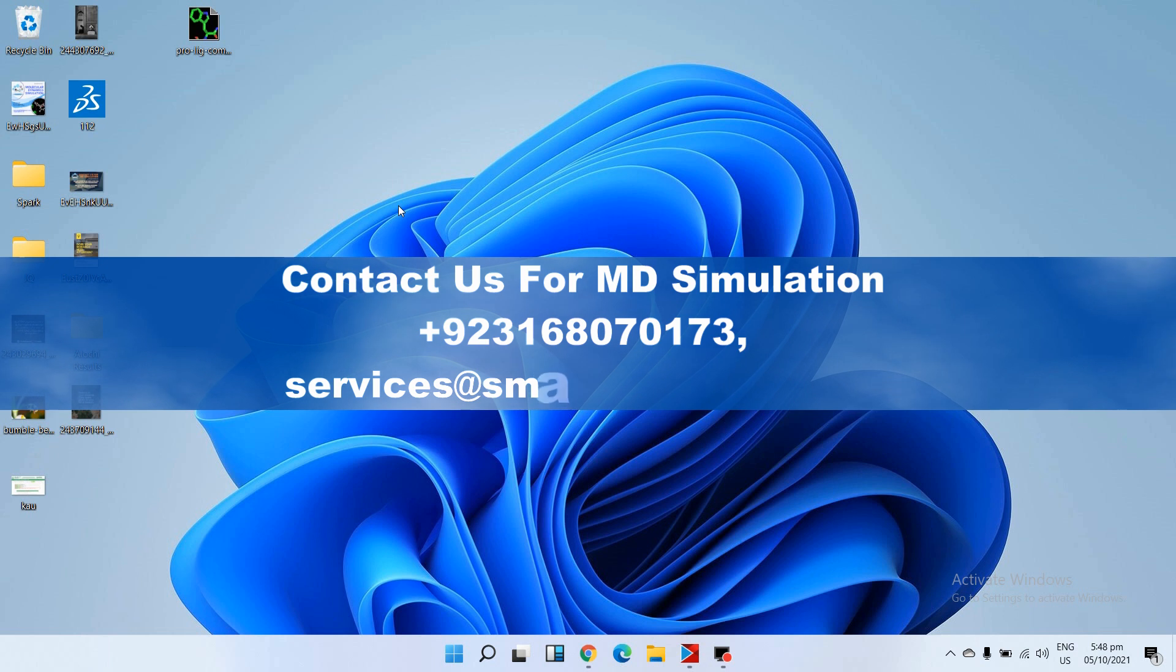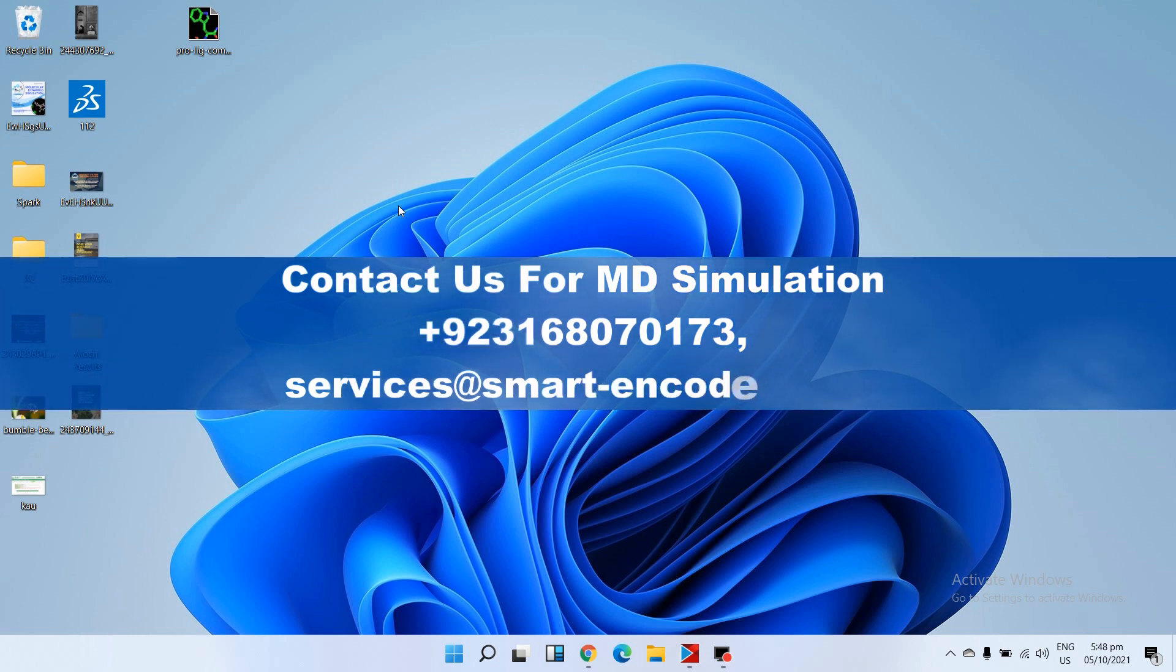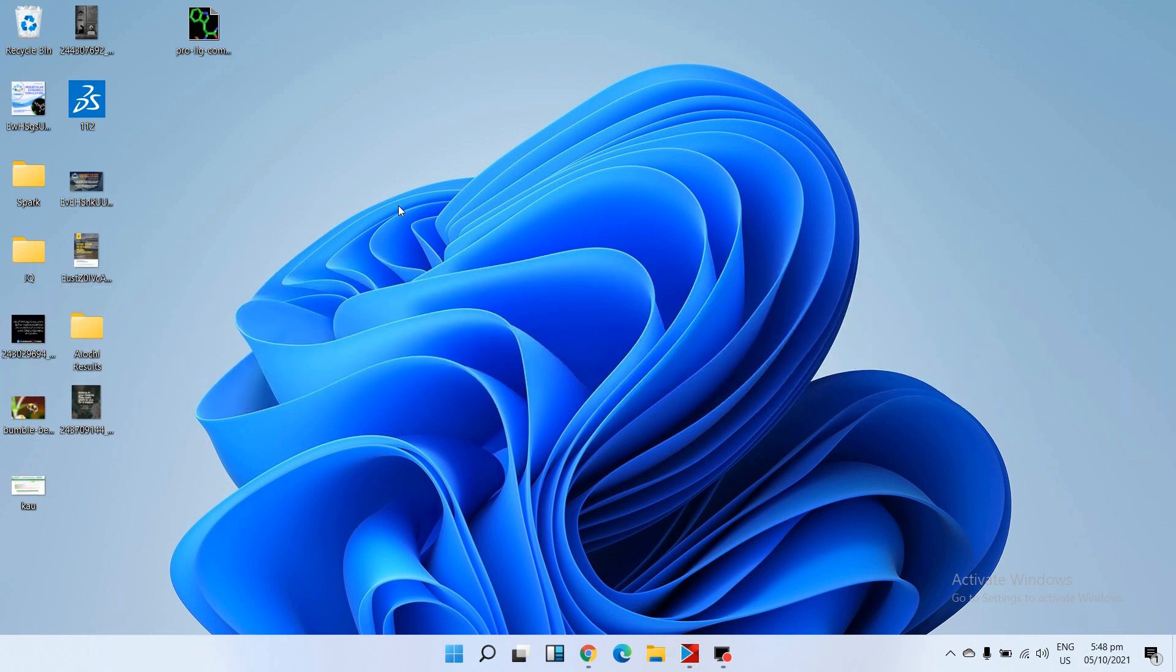Linux operating system or Macintosh - you can use any distribution of Linux operating system. First of all we must have a protein and ligand complex. Here we have it - this is the result of docking. You can make this complex by docking.